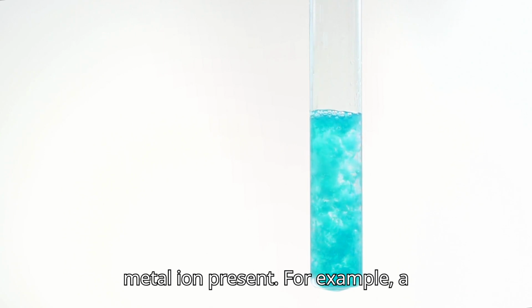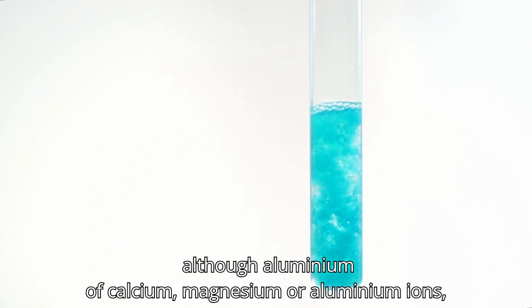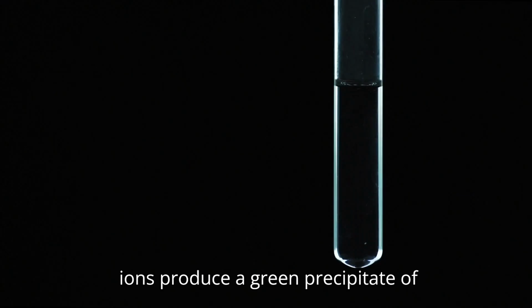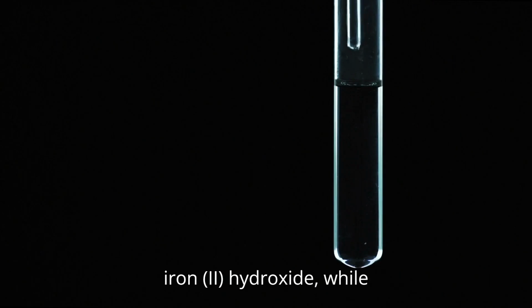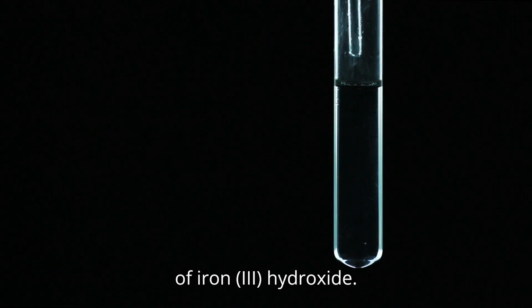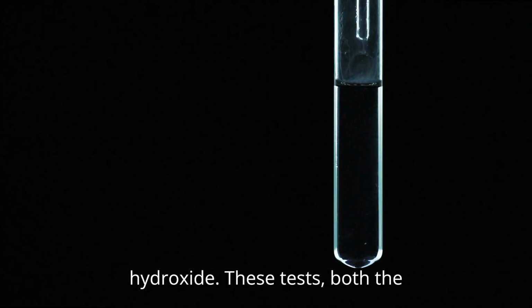For example, a white precipitate indicates the presence of calcium, magnesium, or aluminium ions, although aluminium hydroxide will dissolve in excess NaOH to form a colorless solution. Iron(II) ions produce a green precipitate of iron(II) hydroxide, while iron(III) ions form a brown precipitate of iron(III) hydroxide. Copper(II) ions give a blue precipitate of copper(II) hydroxide.